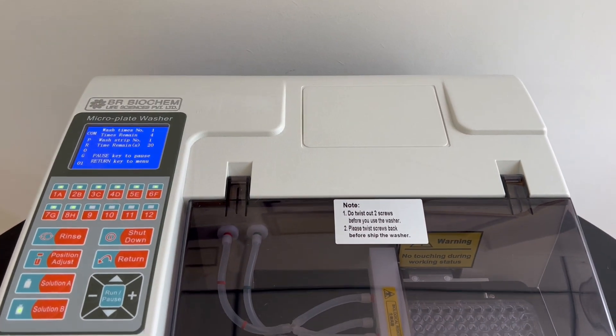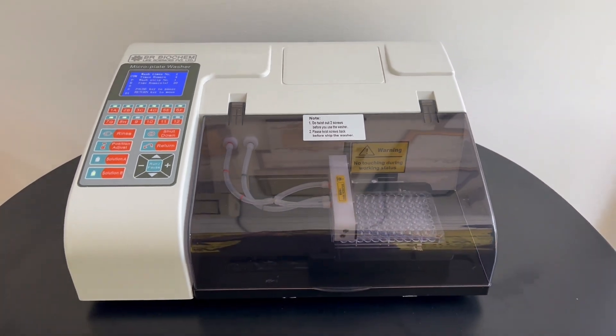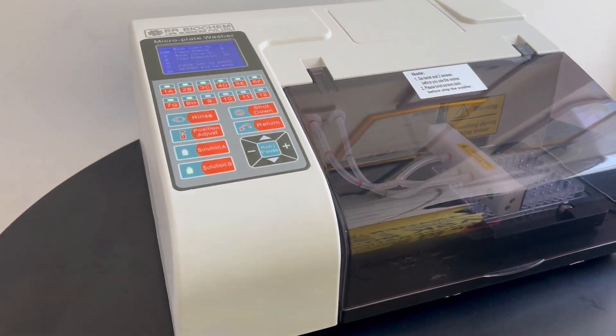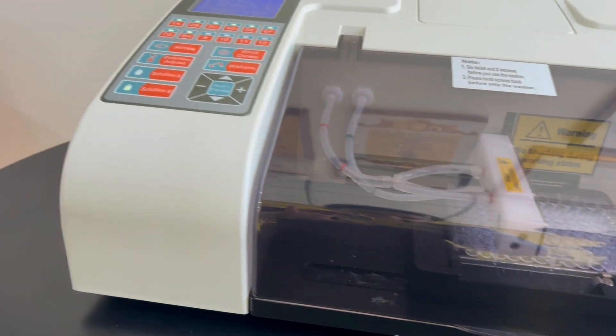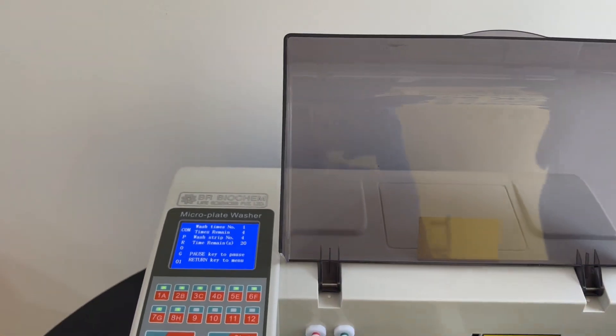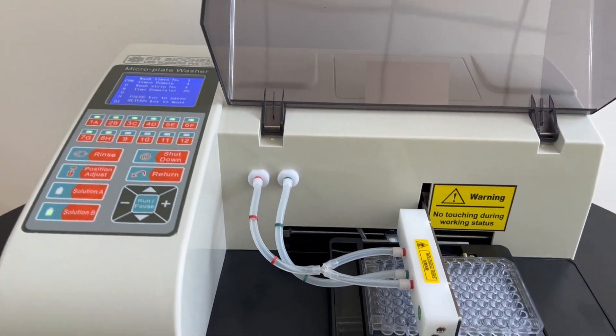Introducing our Advanced Micro Plate Washer, model number BR812, equipped with cutting-edge features to enhance your laboratory workflow. With the user-friendly 3.5-inch LCD display, you can easily name, edit, and save up to 100 wash programs, ensuring efficient and organized operation.